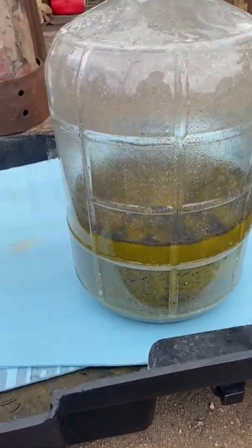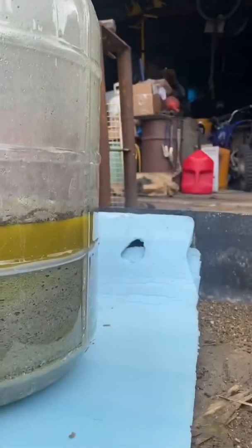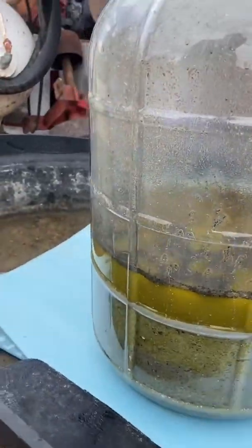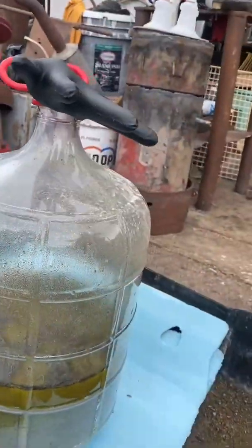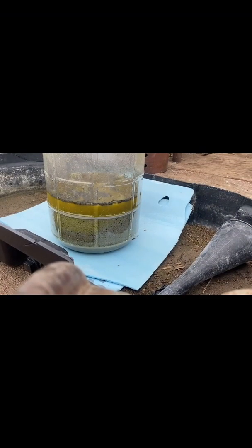We add a little bit at a time because we do not want to blow this, so we can take this on film. Hold on to my phone. I think that's good enough. Hopefully I don't fall.